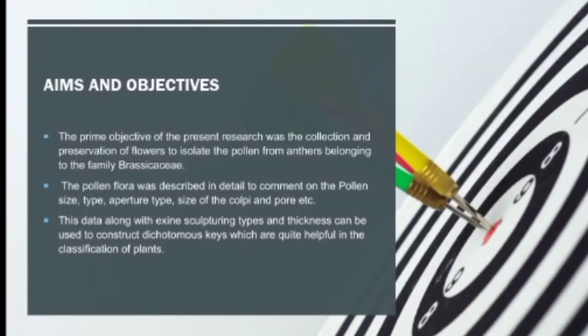The basic aim of this study was the collection and the preservation of the flowers, so that the pollen morphographic characters of the different collected plant species can be examined, and the data obtained from the examination of the pollen morphology of the different plant species can be used to construct the dichotomous keys, and it can be used to assess the classification and taxonomy of the plants.